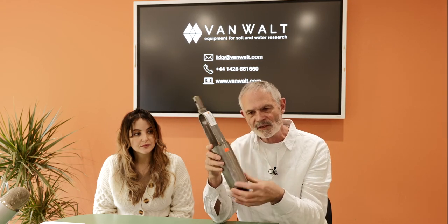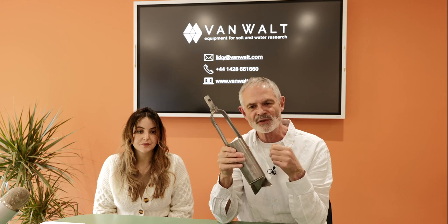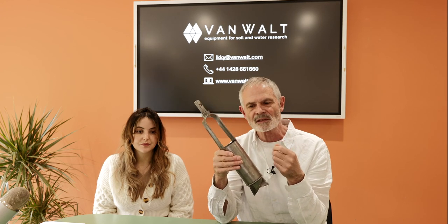Another type of auger head is the sand auger head, but also really good for hard, dry soils. Try not to use this as a standard, because it is more difficult to retrieve the sample, although we will show you a device later on which works in conjunction with this, which can make things a little bit easier from the sample retrieval.